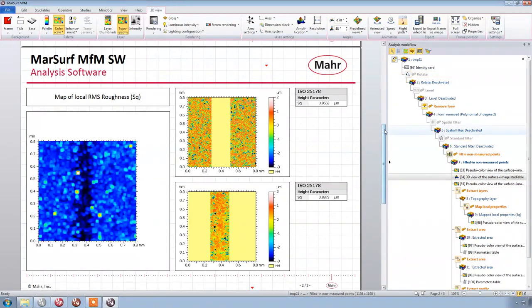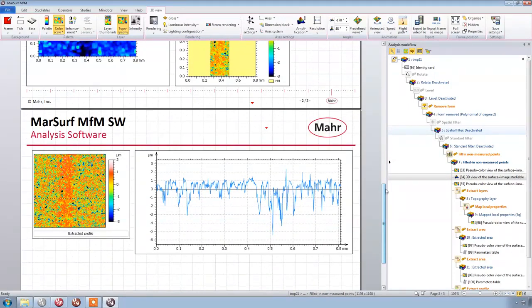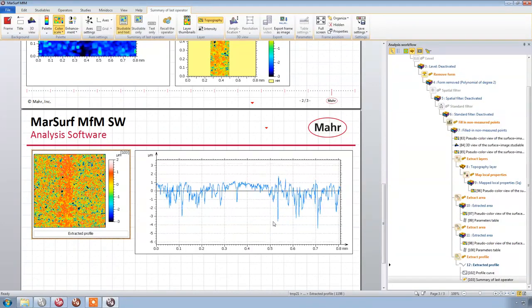If we were just to make a single trace and try to find a height difference where that pencil graphite is, we're just never going to see it. It's tough to tell, but I've actually got a left to right profile extraction here, and I'm just going to drag that around, and you can watch this update. We can look at this and say, oh yeah, there in the middle, there's something different. There's not quite as many valleys, it's filled in.